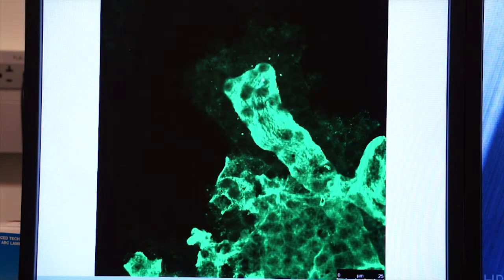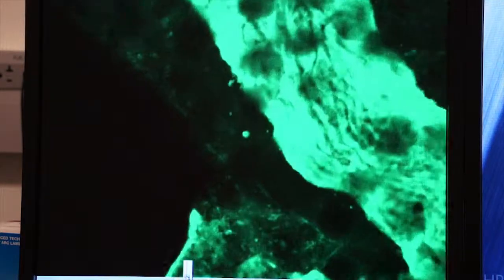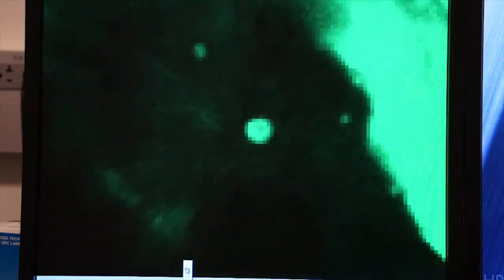You can see the different colors of green and black with the background, and you can see that there's different intensities in this image. If we magnify this image, you will see that we can get to a point in magnification where individual pixels become apparent. Here you see what was once a round circular object, and we're seeing it highly pixelated. Each one of these little squares is a pixel.